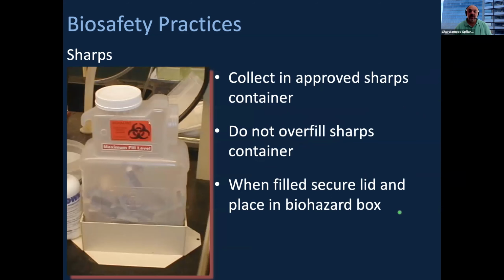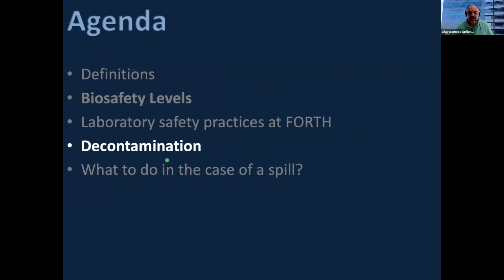We talked about that earlier. Sharps should be contained in approved sharp containers. As I said, we should never overfill them. And after they are packed with sharps, then they should be closed and put in specific biohazard boxes before being disposed.